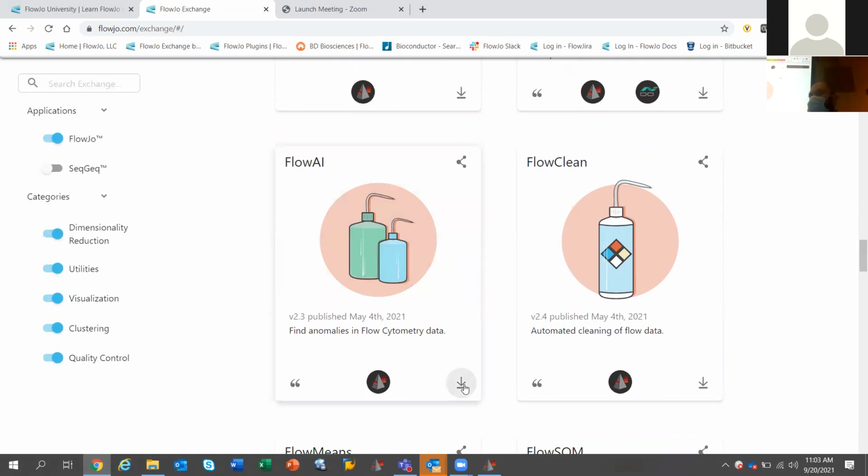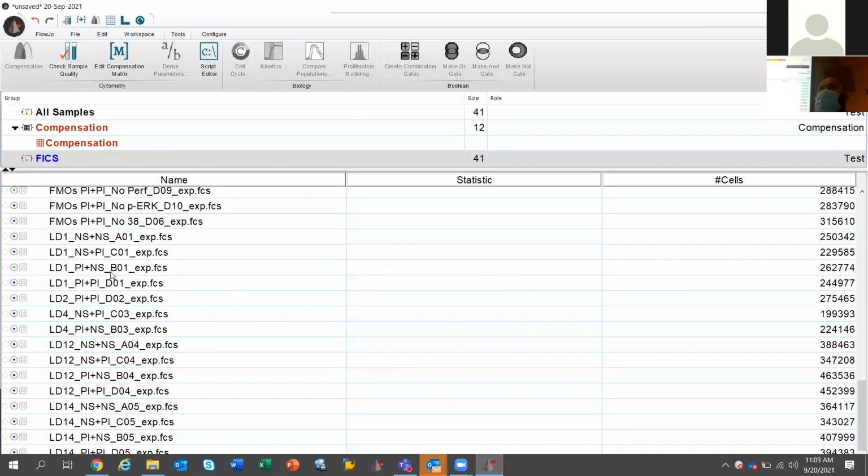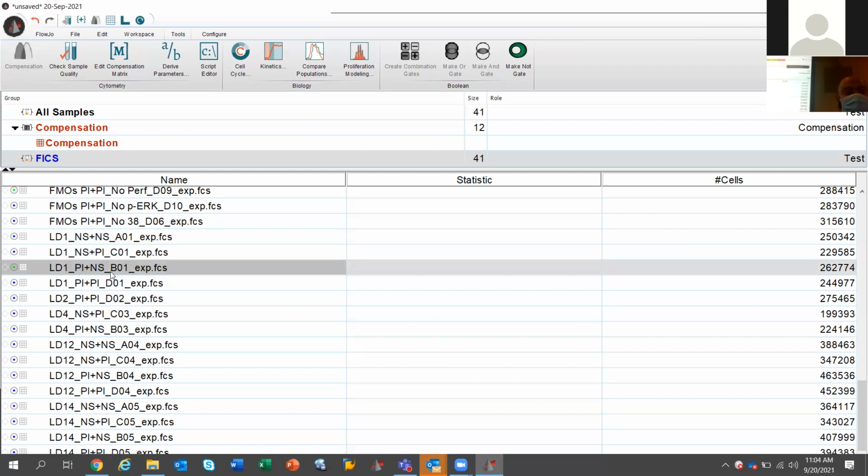I'm not gonna go over how to install plugins today because that's not what the session's about. But again, if you wanna install them and need help, there's your core. There's also Howie here, he could help you today, and Veronica can also help you. And again, I would highly encourage you to download it and to run it, because most journals are now looking for clean data. It's not like the old days that you just submitted flow data and people were like, okay, that's fine.